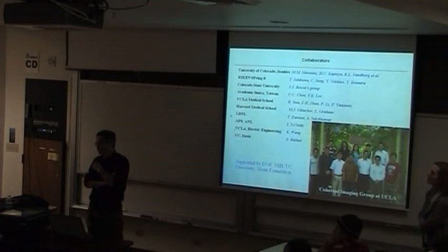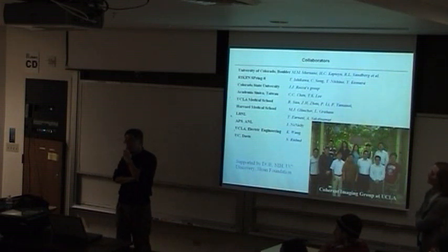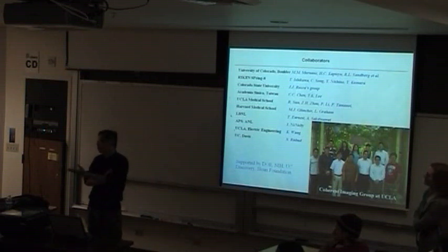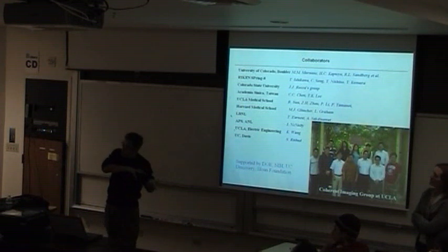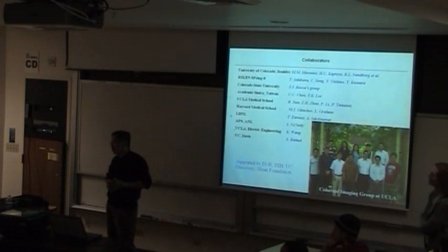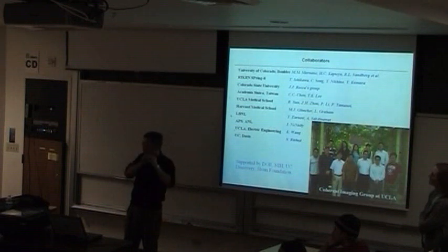But does oversampling change the story? Yes, oversampling changes the story because it makes the solution unique. Otherwise, if it's not unique, it will not converge, which means you don't have a unique solution. With oversampling you measure more intensity points, and that gives convergence to a unique solution. Of course, when noise is there, it's not just one solution; it could be a few solutions.